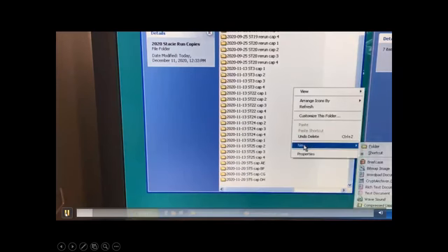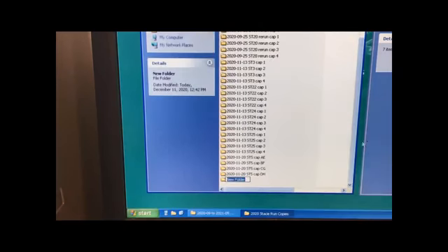Okay, new folder, so you can actually see what's going on there. And I'm going to name this 2020, 1123. And then you can give it whatever, remind yourself what the run was. For Stacy, this was ST3 and ST5. We were rerunning them. Okay, and now notice I'm making one for cap A and E.